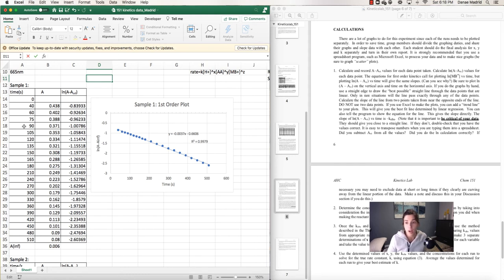and I will tell you within this video when to pause and to insert some data and then move on to the next point, because some of this is just going to take time for you actually to input your data. So input all of your time measurements. For the first run, you likely have more data than you do for the third, fourth, and fifth run, etc., because the later runs went a lot quicker than the first run did. So just write all the time values that you do have down.